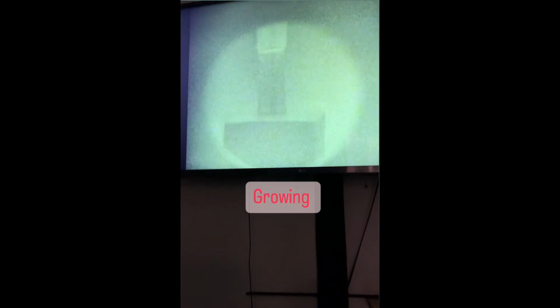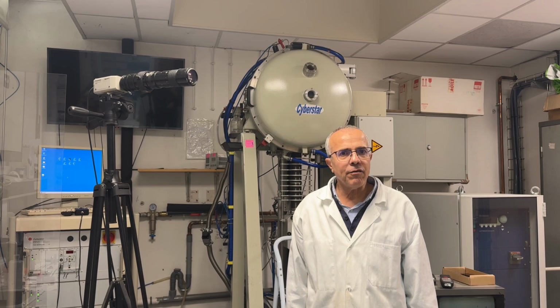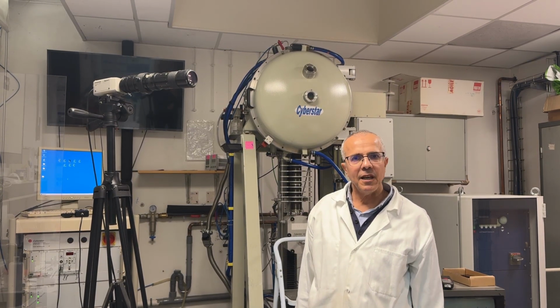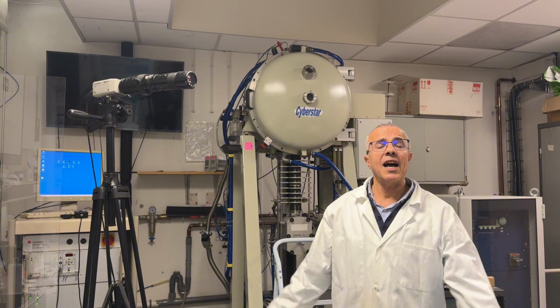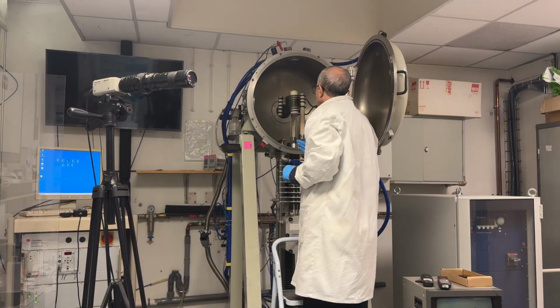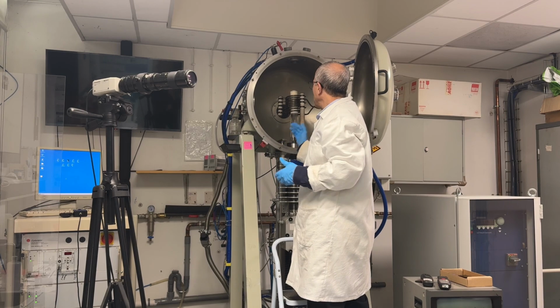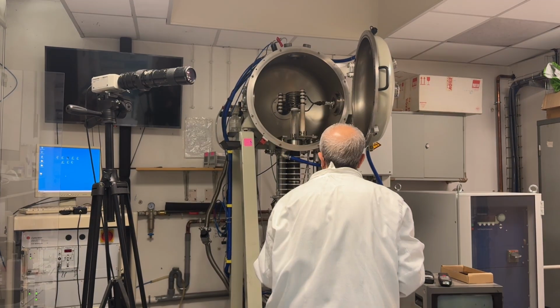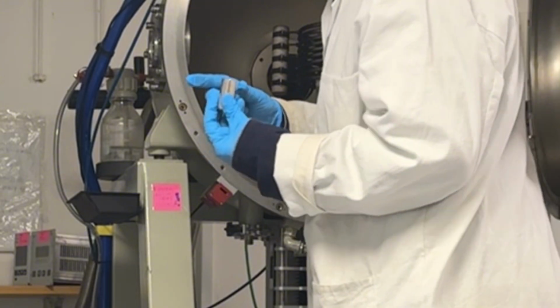After 1 day of growth, now I will open the machine, I will collect the crystal, and I see how it is. At the beginning, I have to check. So everything looks okay, no problem, no damage. I take the crucible. That is my crucible.